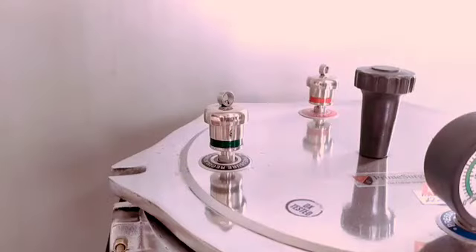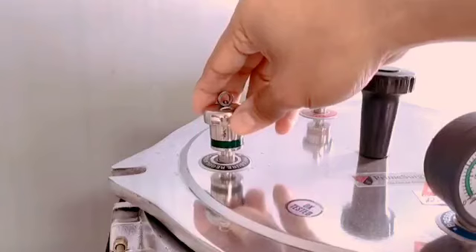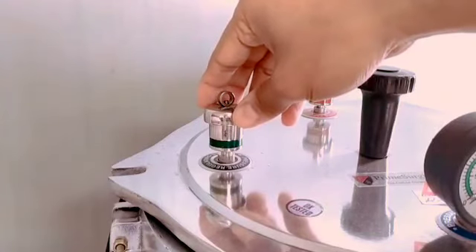Pressure regulating valve or safety valve 1 with a green color code. This whistle-type pressure valve is designed to stabilize and maintain a sterilization pressure of 15 pounds per square inch within the autoclave chamber by letting out excess steam from the autoclave when it exceeds the 15 psi. So it's pretty much like an incubator thermostat that maintains a constant temperature within the incubator chamber.